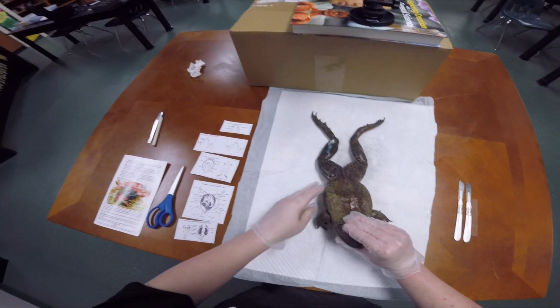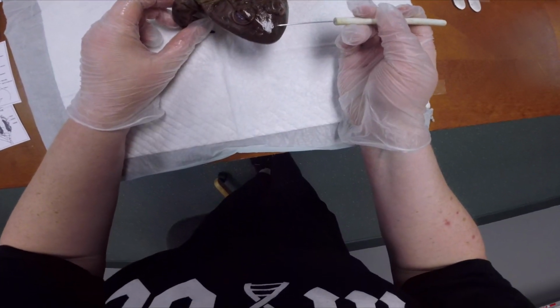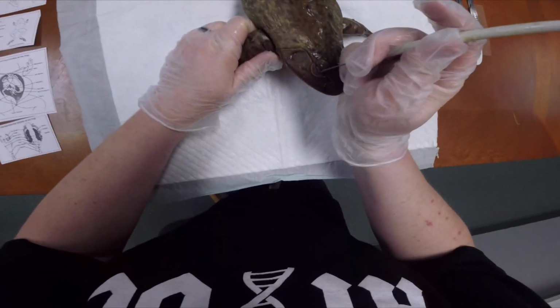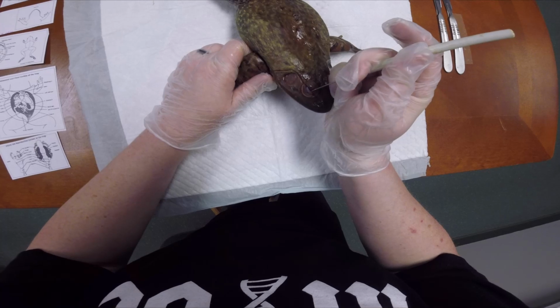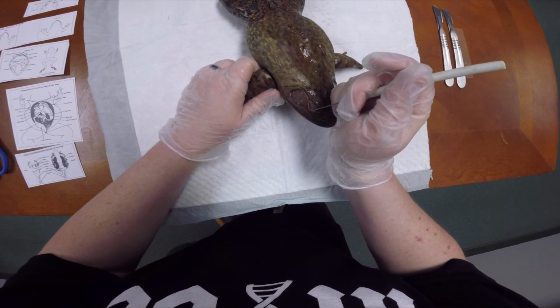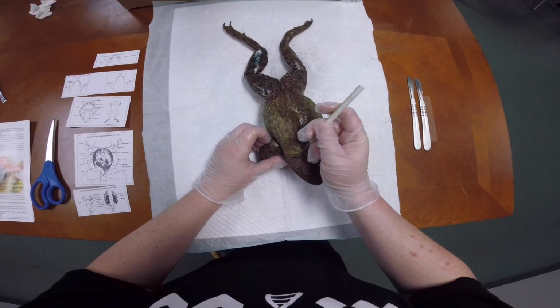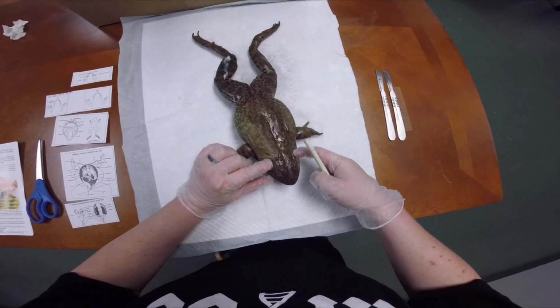Here you have the external nares, which are right here and here. That's kind of their nostrils, if you will. Then you can see on the eye the nictitating membrane, the third eyelid, and you can see there's one here. Then there is the tympanum, which is right here. That is kind of their ear, if you will. They have one on each side.